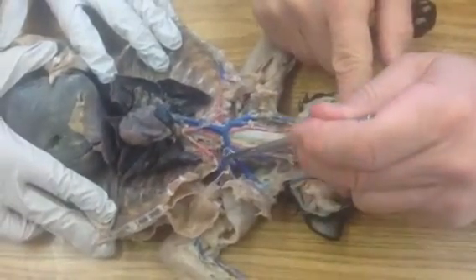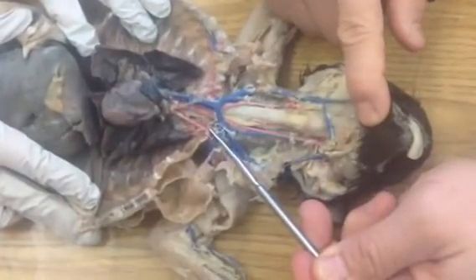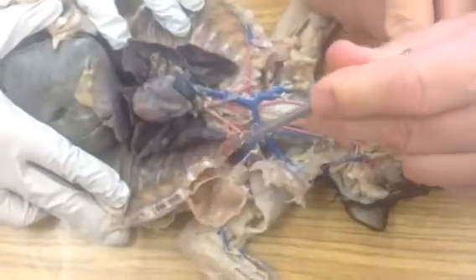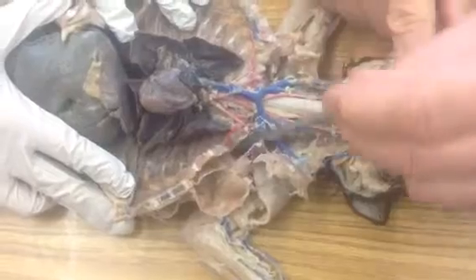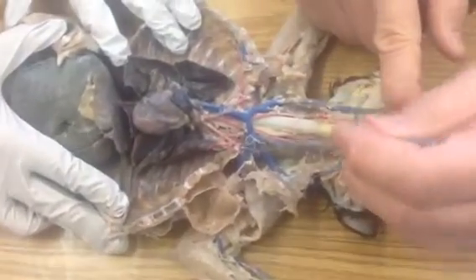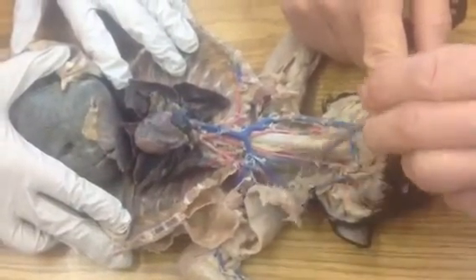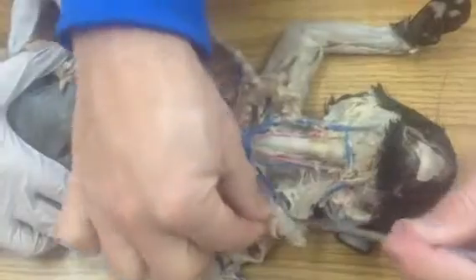Off of your left subclavian, since these are open and you see them really well, the first one's the vertebral. The second one underneath here is your costocervical. The third one is your thyrocervical. The one that's broken and hanging off would have connected to your sternum. So that's your sternal or mammary.